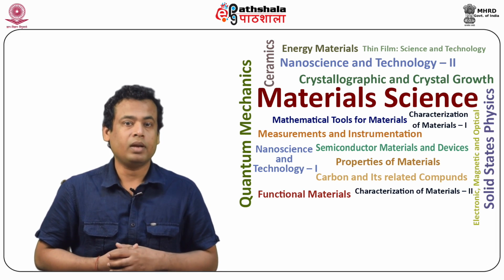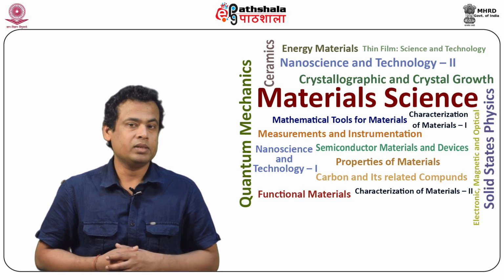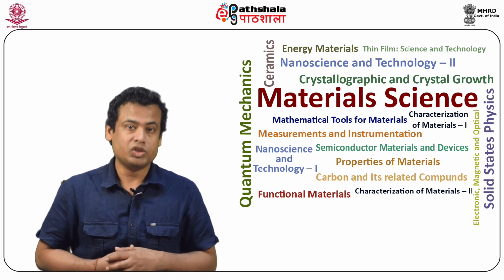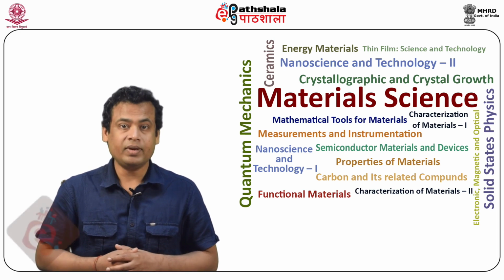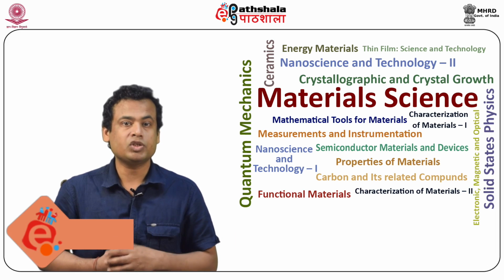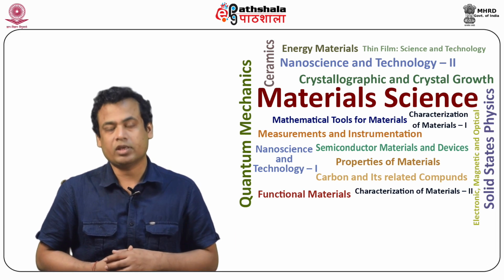Factors like work function, atomic number, beam energy, beam current and surface tilt can affect the secondary emission of electrons. The backscattered electrons are high energy electrons produced during elastic scattering and can be affected by factors like beam energy, tilt, and atomic number of the specimen. The interaction volume increases with increasing acceleration voltage and decreases with increasing atomic number.